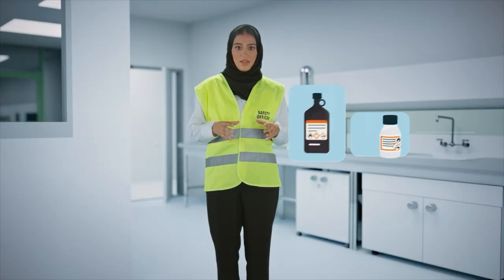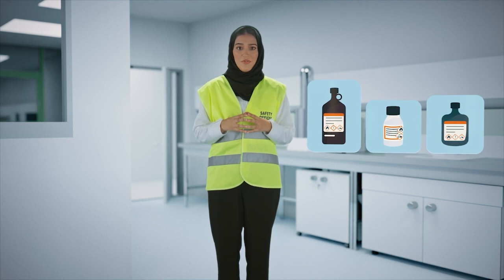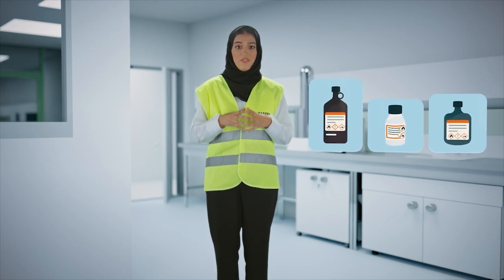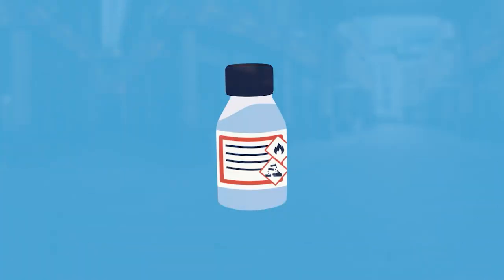Proper labeling on chemicals is essential. Numerous adverse incidents can be tied back to improper or insufficient labeling of chemical containers. Labels are typically referred to as manufacturer and secondary. It is necessary that a manufacturer label is never altered, covered, or otherwise changed until the container is verified as being empty. Typically, empty containers will be reused.